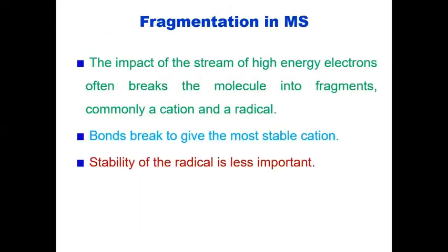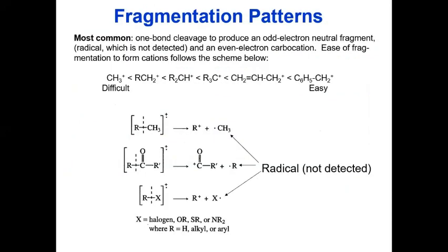So, fragmentation. Another topic is the fragmentation pattern of molecules. In the syllabus, one topic is the McLafferty rearrangement. Here, in the McLafferty rearrangement, we will see how the molecules are fragmented. Before we understand the McLafferty rearrangement, first we will see the simple fragmentation of different molecules.